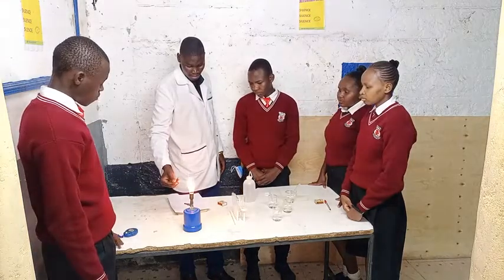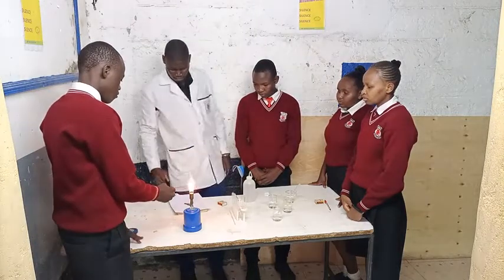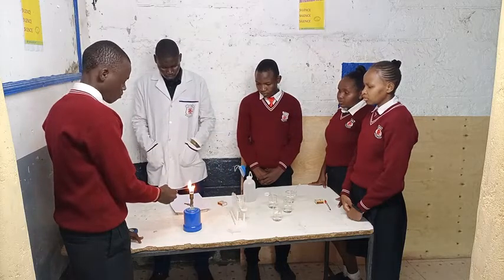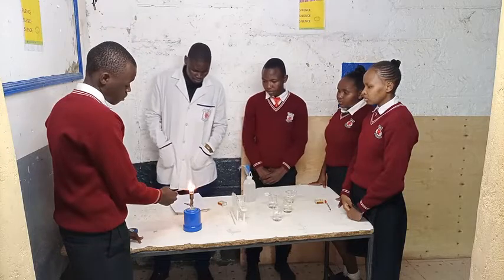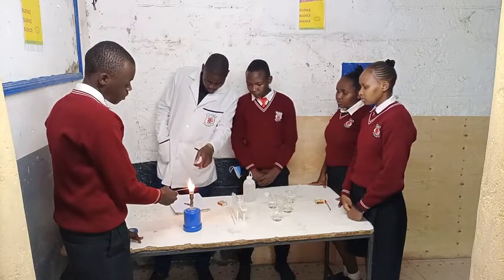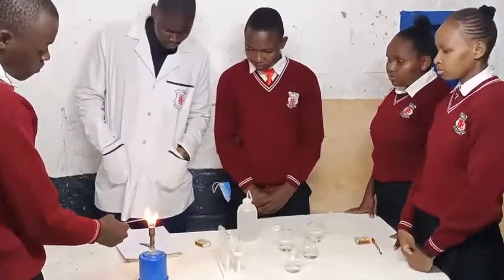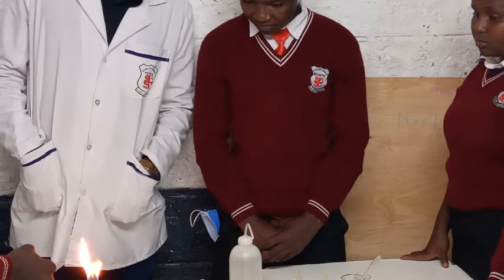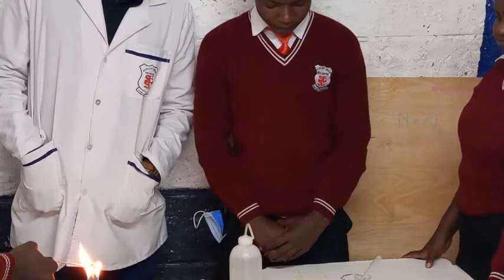Now, are you seeing those fumes coming out? Which color? Brown. Brown fumes coming out. Very good.